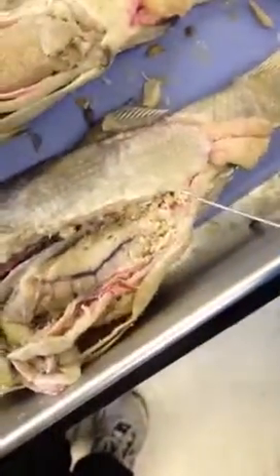Awesome. Now one more thing that we have to do is the ventral gonadal artery. Due to the staining, sometimes you might not be able to see it, but it would be right around the vent opening, where we cut from the fish. You can see it on this one. Where would it be? Right here. Okay, so we're going to show you in a second.